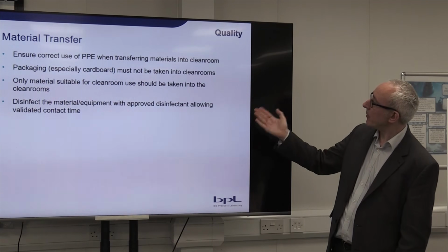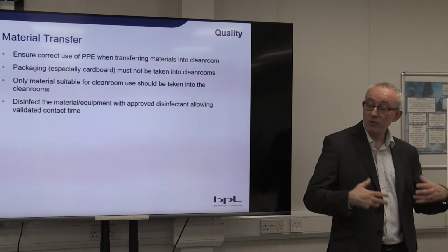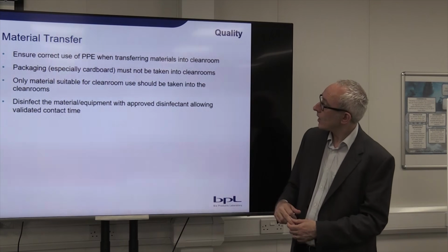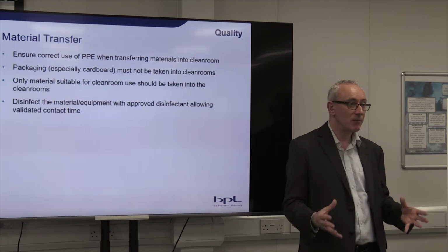Okay, so for things going into the clean room, we've covered a number of these aspects, but it's always important to be correctly gowned as well to avoid extra contamination. Always avoid cardboard. Only allow authorised materials to go in, and everything going in is disinfected.